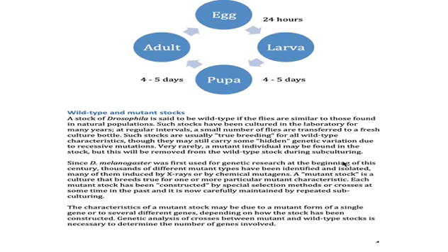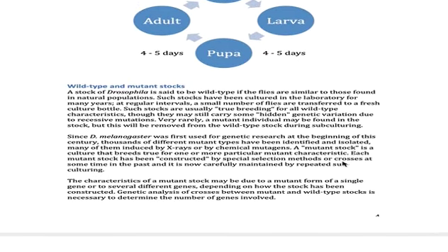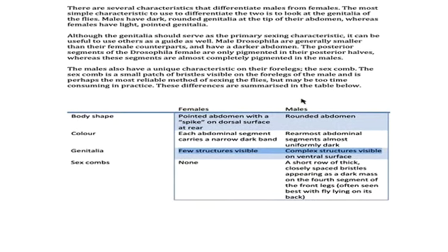There are other things I'd like to move on to rather than spending such a significant chunk of our time performing fruit fly crosses. Now, in terms of sexing the flies, you can identify females and males. This is actually something that I encourage you to do if you have fruit flies at any point in your home. I have a compost bin at my house, and so we regularly get fruit flies, and I will occasionally capture a couple of them in a jar and then bring them into class and see if folks can sex them. So don't be surprised if I do that at some point this semester as it warms up to help make it interesting for folks who intend to work in any kind of field with insects.